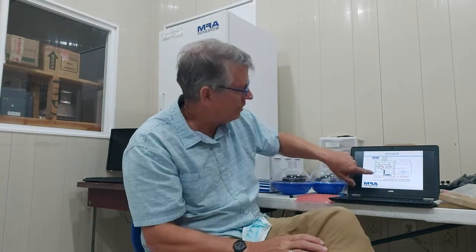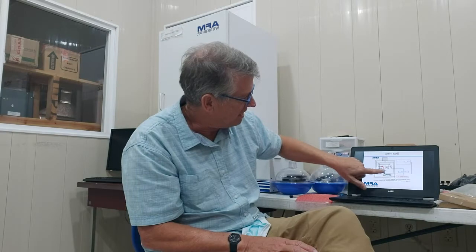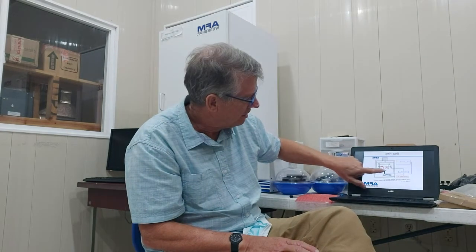Now, yesterday you asked me what the error signal was, the right-hand side image that we had up there. So what happens is, if the feedback loop can't keep up, the probe hits the edge of the surface, hits the edge there and it bends. Okay? So that's the error signal. It's the difference between the set point and the measured value.